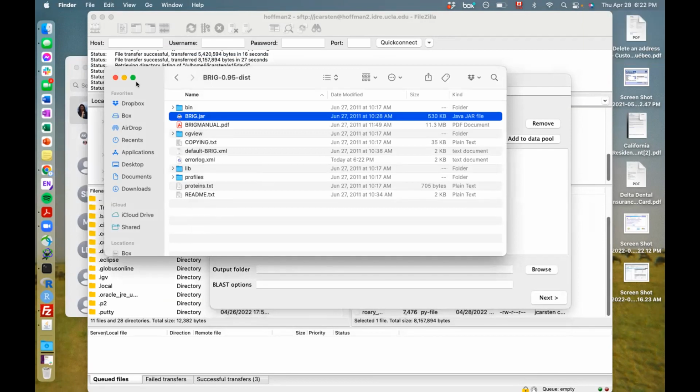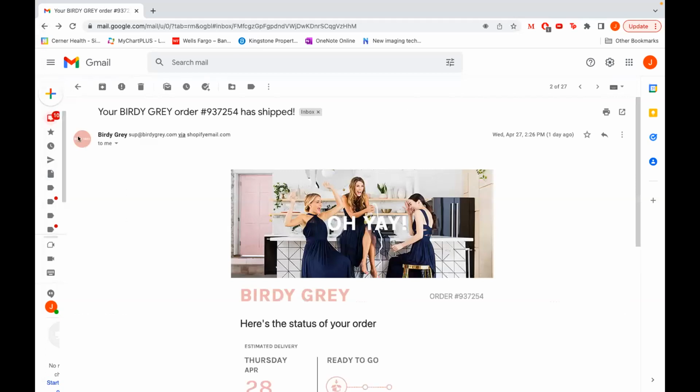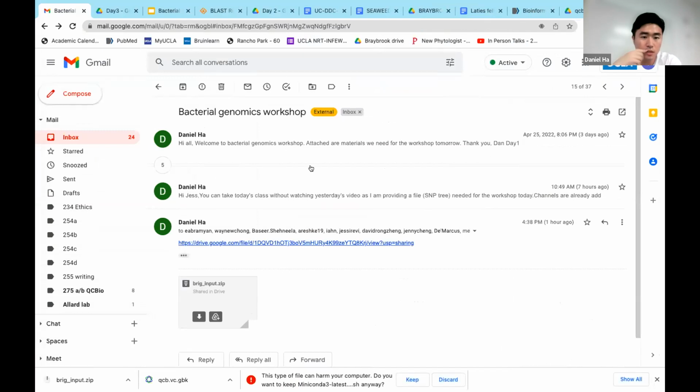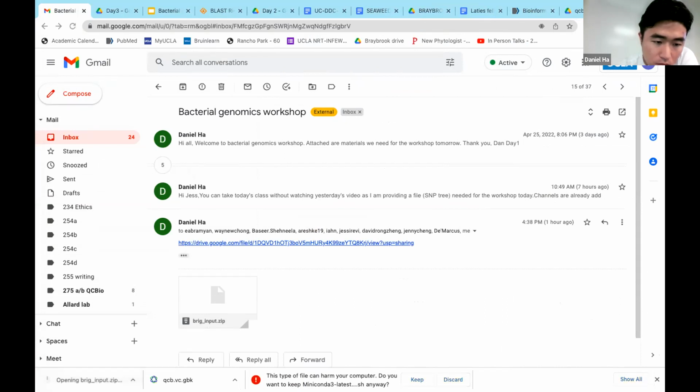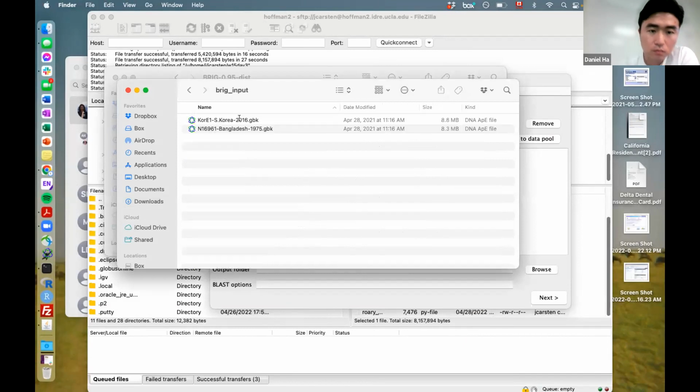The Bangladesh and South Korea files. Oh, sorry, that's the wrong inbox. Here. If we do this. Oh, yeah. Yeah, you have it here.